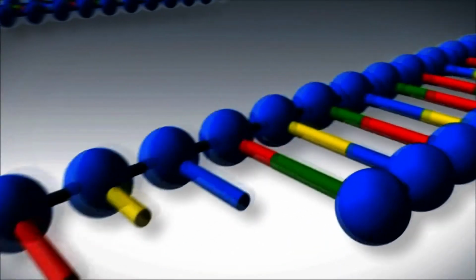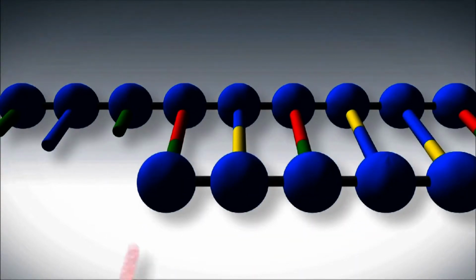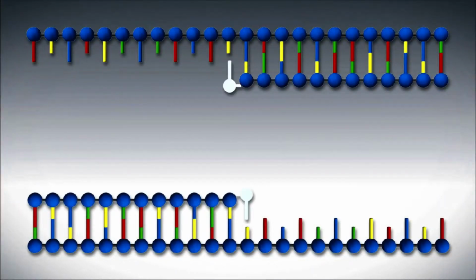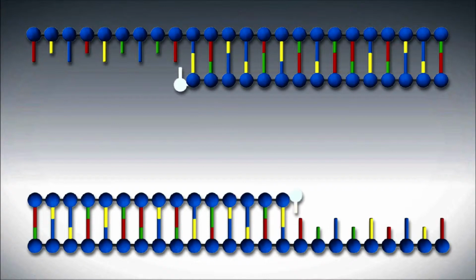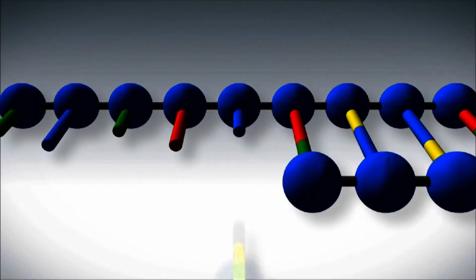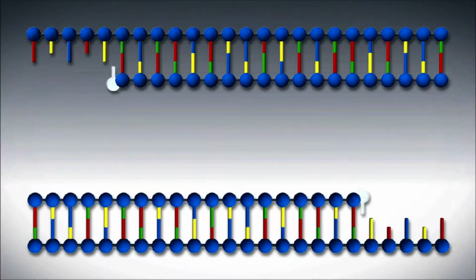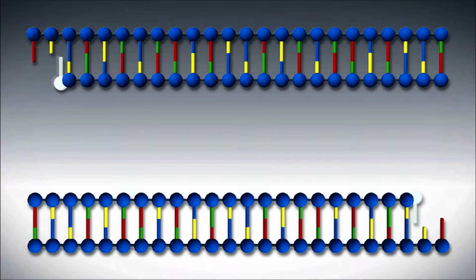During the final step called extension, a heat-stable enzyme called Taq polymerase is used to fill in the gaps of each of the single-stranded DNA fragments at 70 degrees Celsius. This creates 2 copies of the original double-stranded DNA, with each of the new molecules containing 1 old and 1 new strand of DNA.